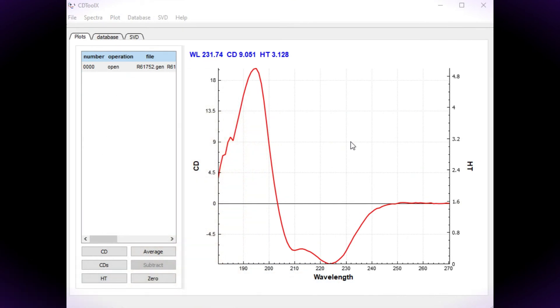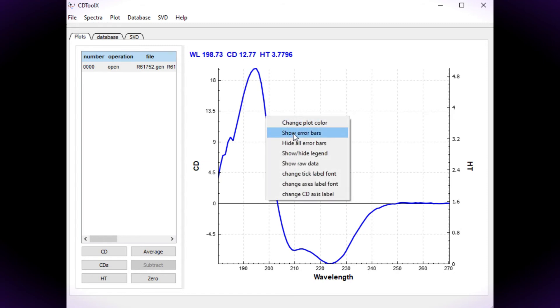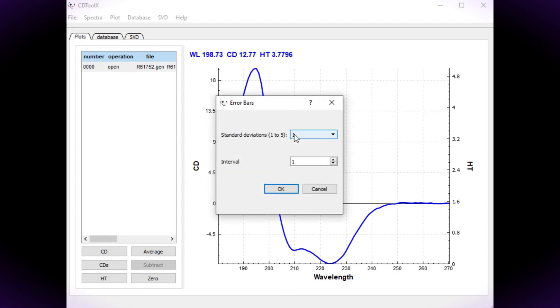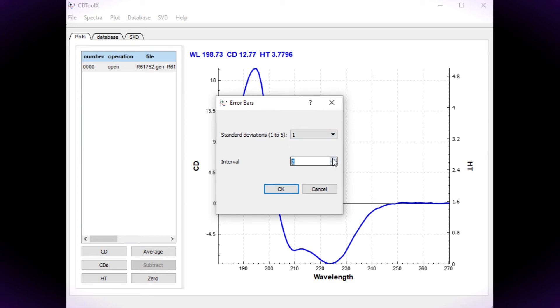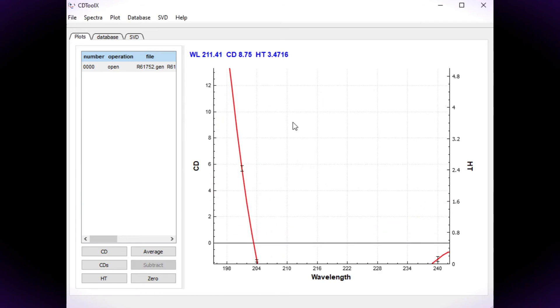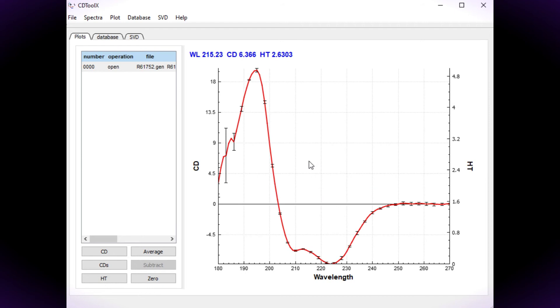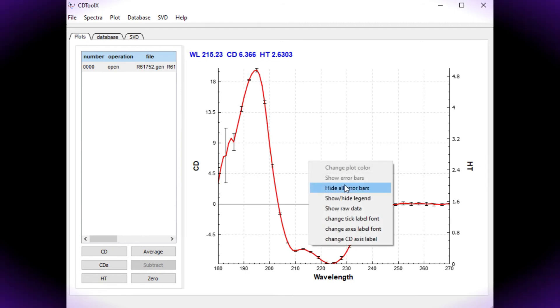The error bars can be displayed on the plot. Select the spectrum which will turn blue when selected. Right click and choose Show Error Bars from the menu. There is a choice of 1-5 standard deviations and any wavelength interval. To remove the error bars, right click and choose Hide All Error Bars.